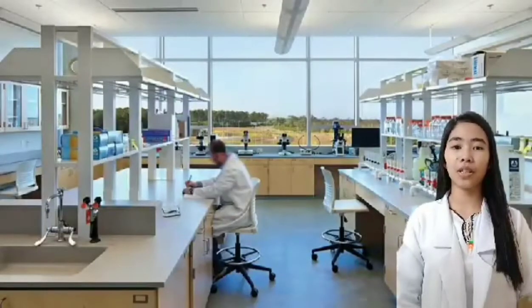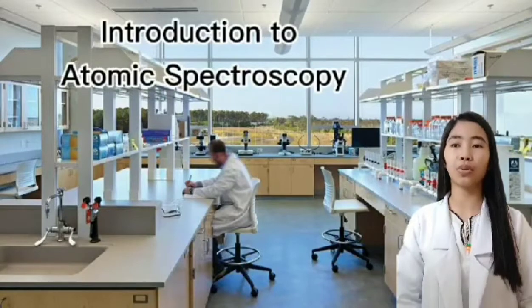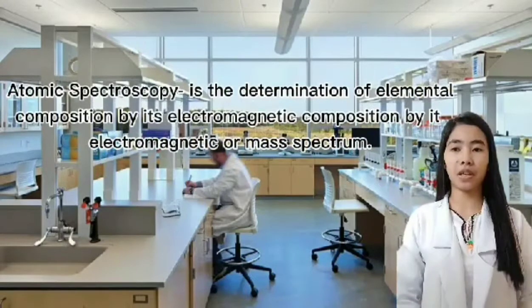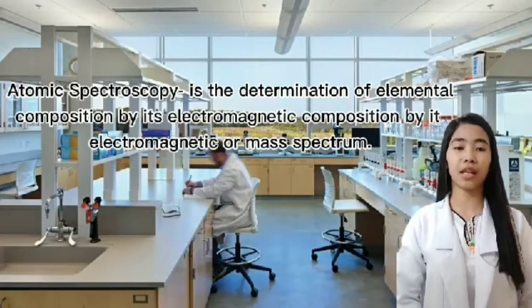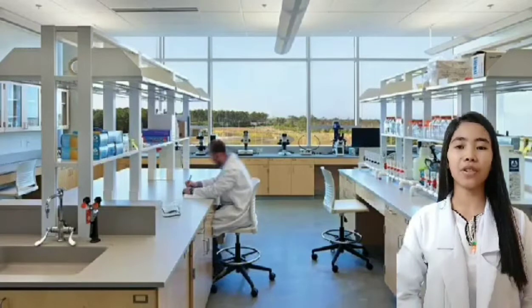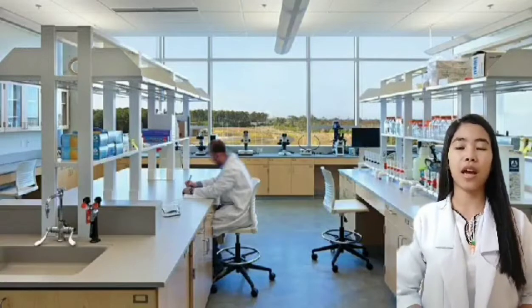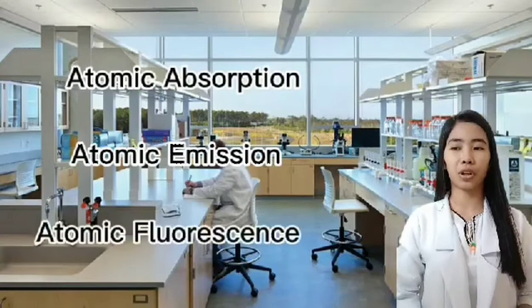Good morning everyone, it's me Christine Aloy and my topic is all about Introduction to Atomic Spectroscopy. Atomic spectroscopy is the determination of elemental composition by its electromagnetic or mass spectrum. The science of atomic spectroscopy has yielded three techniques for analytical use. We have atomic absorption, atomic emission, and atomic fluorescence.